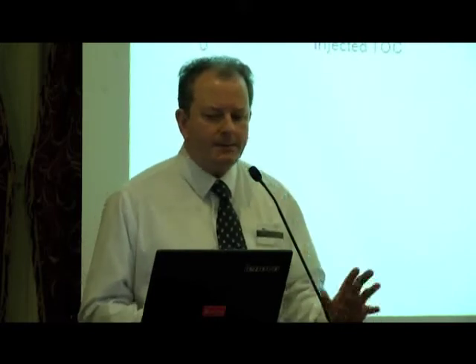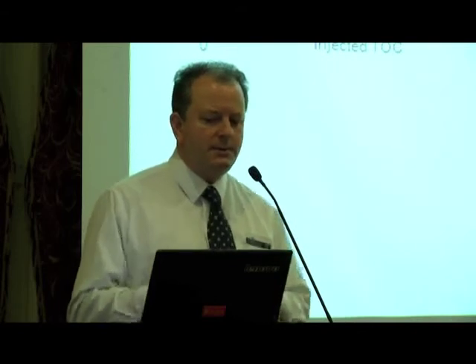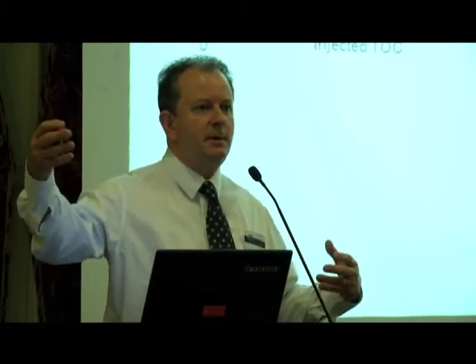So let's take a look at verifying the calibration itself. As I mentioned, the TOC analyzer is based on conductivity. Now typically in the factory, when these analyzers are made, there will be a very thorough calibration performed, typically between 1 ppb of TOC right up to 1000 ppb. This needs a specialist water treatment system that allows us to control to very low levels. So we do that in the factory. However, on site, once it's installed in your factory, what we do on site is a 3-point calibration, 3 points.